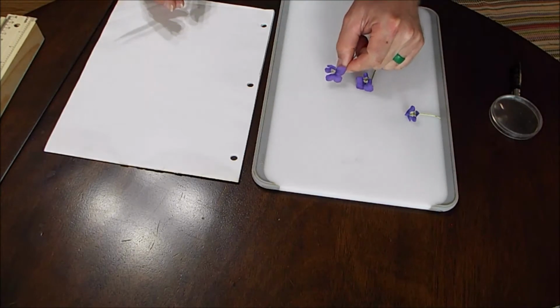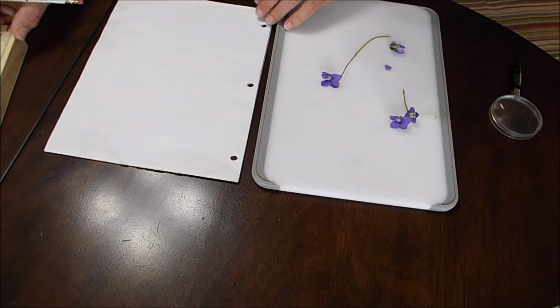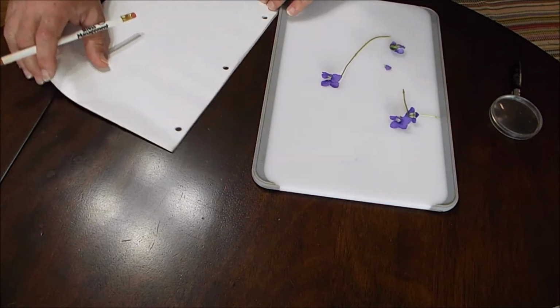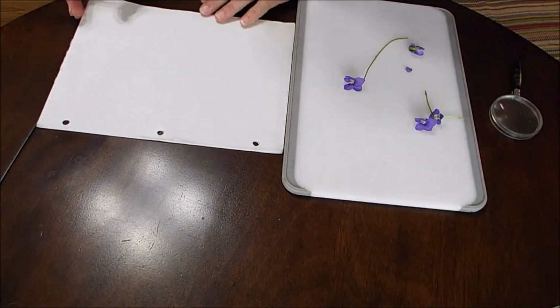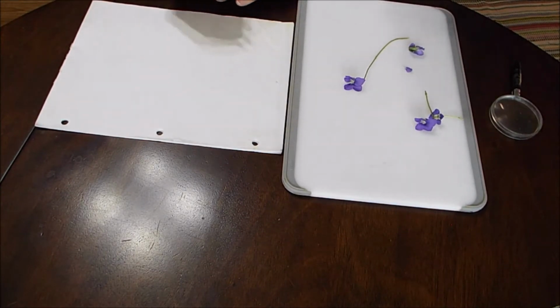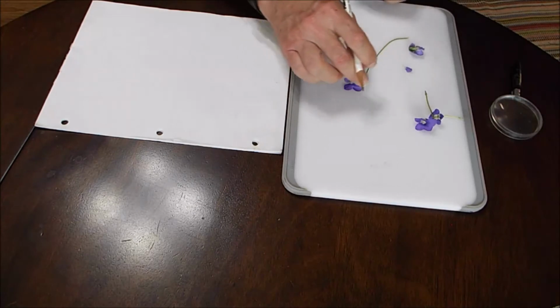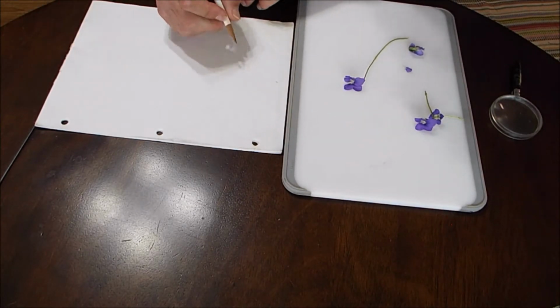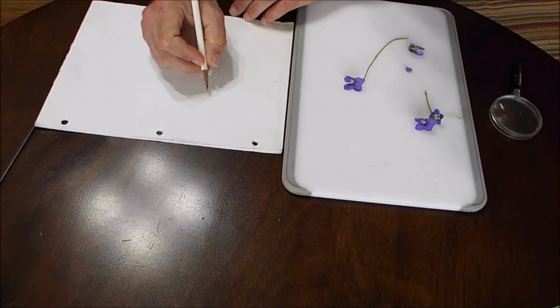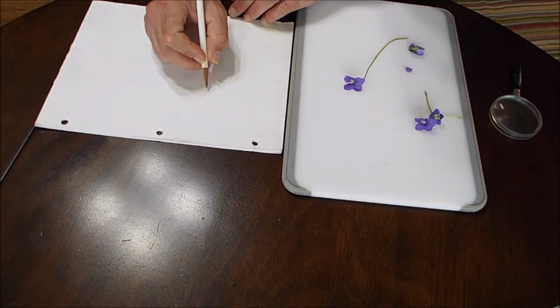And it doesn't matter that I can't see all parts of the flower. In fact, a lot of the parts would be quite difficult to see because they're inside. So we're going to ignore that part for now, and I'll do my first study of this flower. And since it's kind of long and skinny this way, I'm going to orient my page like so. I'm not the greatest artist in the world, but I'm just going to freehand this.